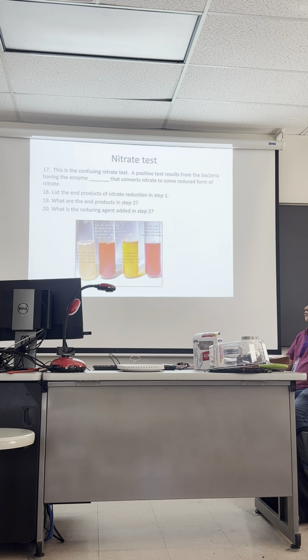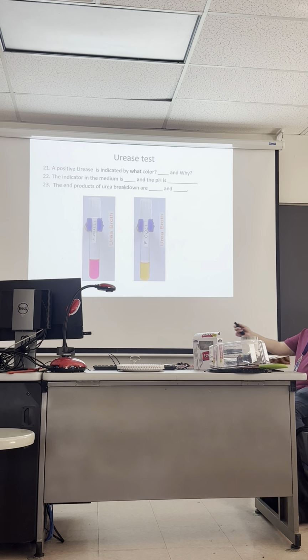Is this what you're saying fuchsia is? Okay, yeah, I won't use the term fuchsia for the nitrate test, it'll be red. Okay? Now this is fuchsia, for sure, right?